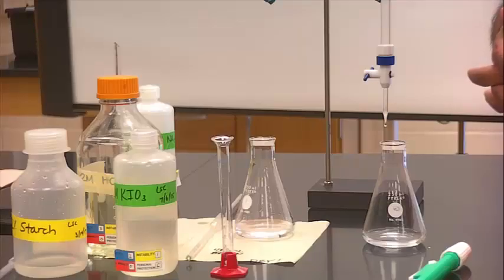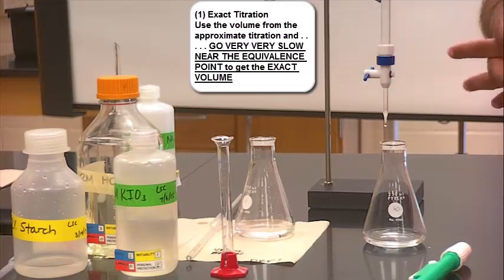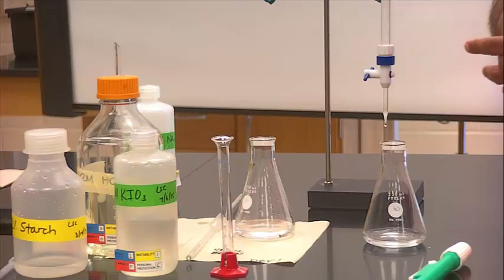We'll then do what's called the exact titration. In the exact titration, you will go 1 mil before the equivalence point from what you obtained in your first titration, the trial titration, and then right at that equivalence point, maybe a mil or 2 mils before, you're going to go drop by drop.